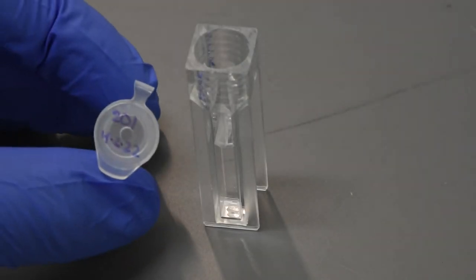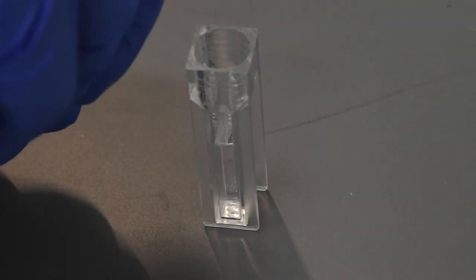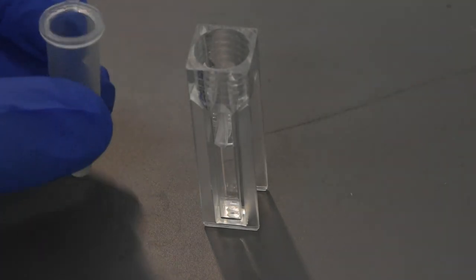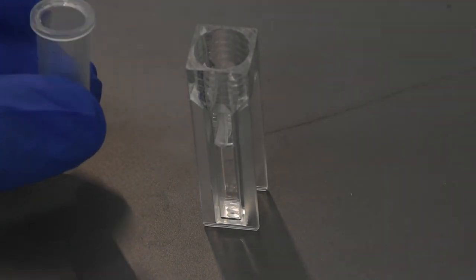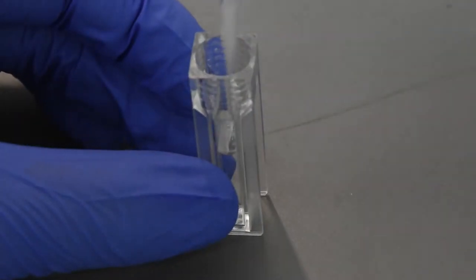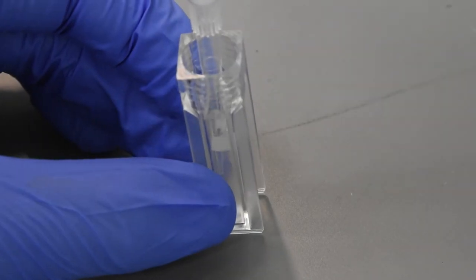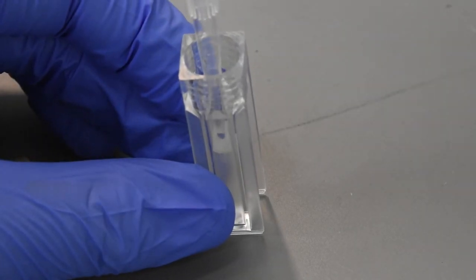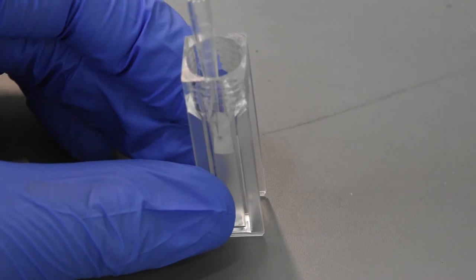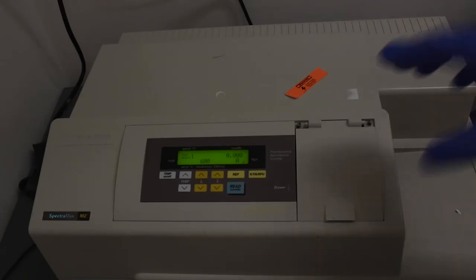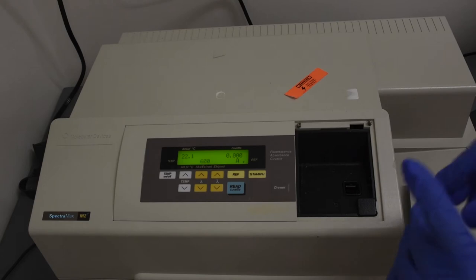In that same cuvette, add 50 microliters of cell suspension and pipette up and down to mix. The liquid should be evenly turbid. Measure the OD600 and record for each.